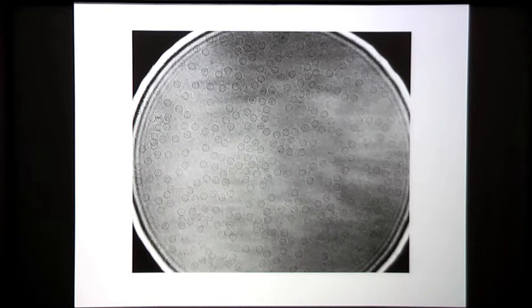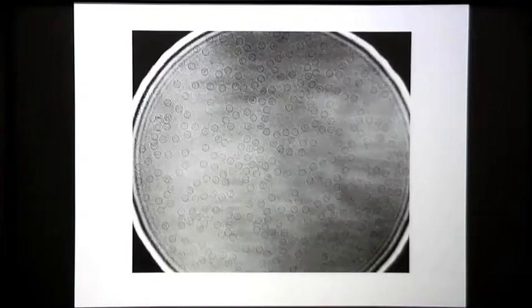A virus, again, this is the core particle from hepatitis B virus that I've worked on for some years. And this is a picture taken by Bettina Bircher. And you can see now very nice details in the particles, no stain, and everything you see here is biological scattering material. So you have some chance of finding out biological structures, not merely biological envelopes.